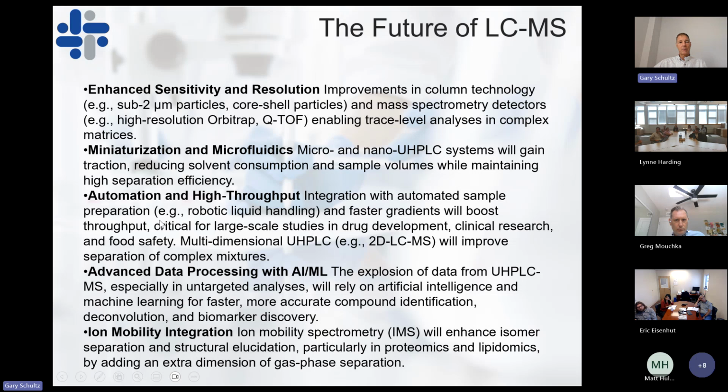More and more, there's automation both at the sample preparation at the bench leading up to the MS, but also there's lots of systems that are being commercialized today that incorporate automation of sample preparation and analysis all into one integrated system. And that's some of the new technology that's emerging today.